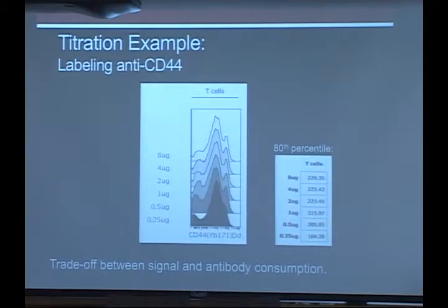And so in order to measure those sorts of events, what we often will need to do is take unstimulated cells or cells that have been stimulated with some sort of perturbogen that induces the signaling pathway that we're interested in, and use those two conditions as our positive and negative controls in order to titrate antibodies of interest. So exactly what you use as those control groups varies depending on the biology of the target, but hopefully this gives you a framework of how you'd go about thinking about that for your own biological questions.